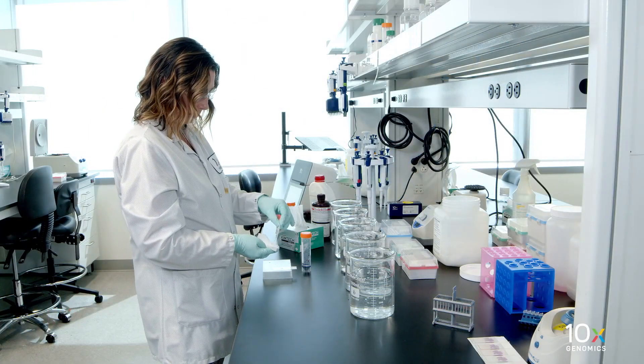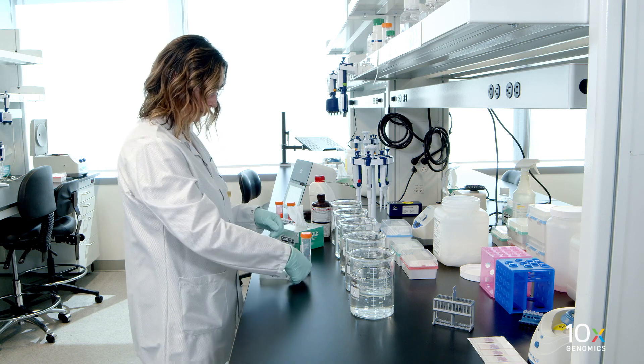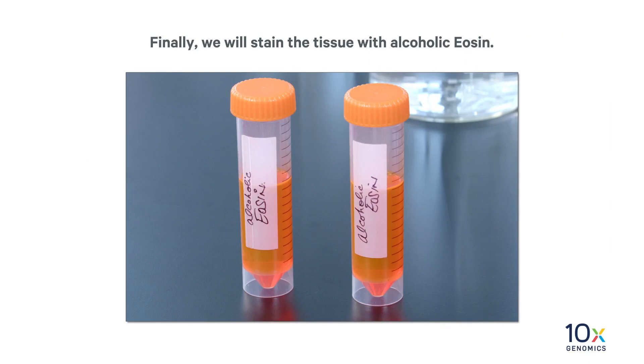Wipe the excess liquid from the back of the slide without touching the tissue section. Place on a flat, clean, non-absorbent work surface. Some droplets may remain. Finally, we will stain the tissue with alcoholic eosin.